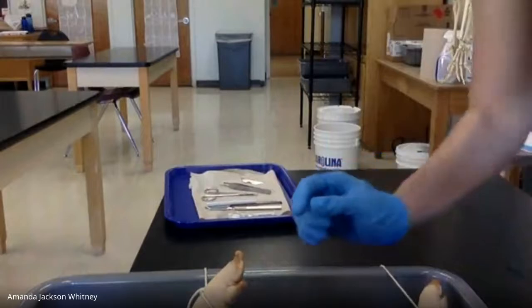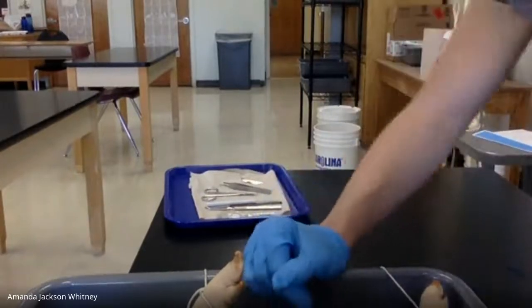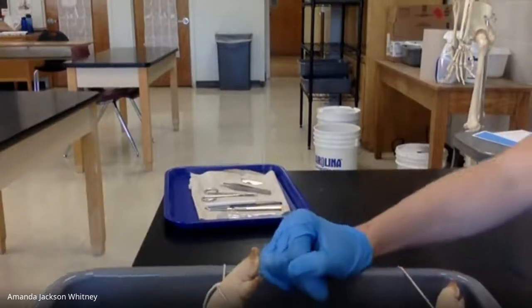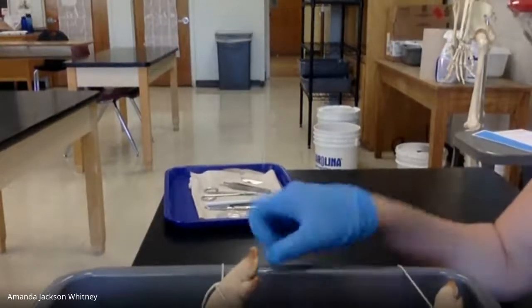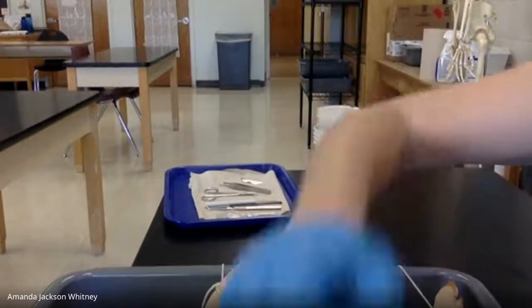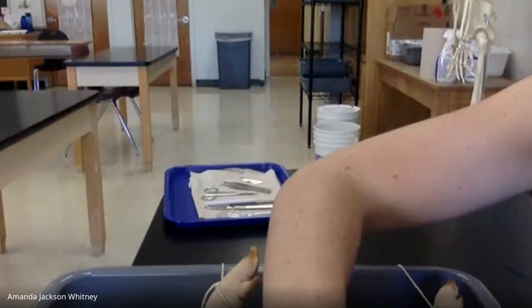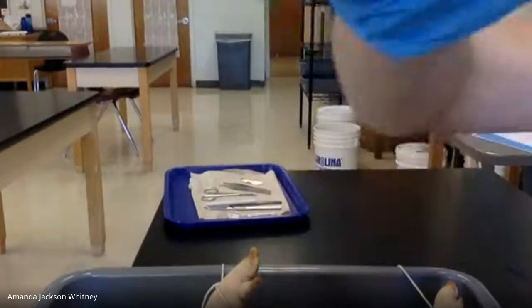All right. So our pig, I'm actually going to say for this afternoon, this is Louie. Louie is another group's pig. We're going to dissect Louie today, and we'll see our pig again when we come back.